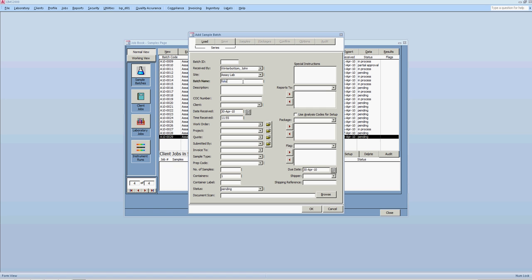And then Folio, number one, two, three, four, five, or whatever. It's a new name. Folio two, three. Okay. That's for instance.